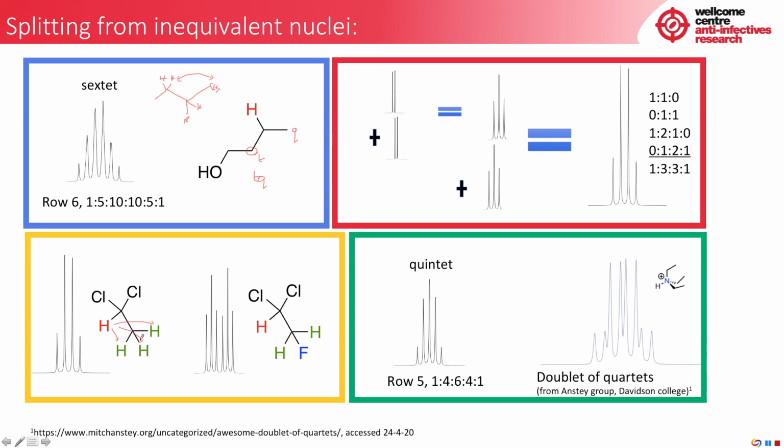And you can actually see this if you replace one of the protons with a fluorine. You're seeing coupling to the same number of spin-half nuclei, but this J value is quite different. And what results is a doublet of triplets, where here we had a quartet. So their origins are the same, the differences are in the J values. And in fact, all of these sort of composite signals, doublets of doublets, doublets of triplets, triplets of quartets, whatever, are constructed in this fashion.